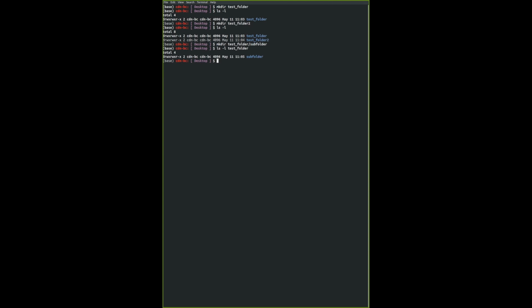I do keep continuous folder names with a hyphen or underscore. And the reason is because it's easier for you to type out names of files and folders with a full name. But sometimes I understand that you want to create a folder with a space, you know, to make it neater. To do that, you have to actually type out the name of your directory within inverted commas. So this is assuming that you are inputting a string or character.